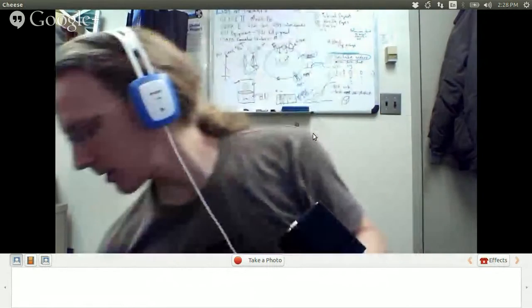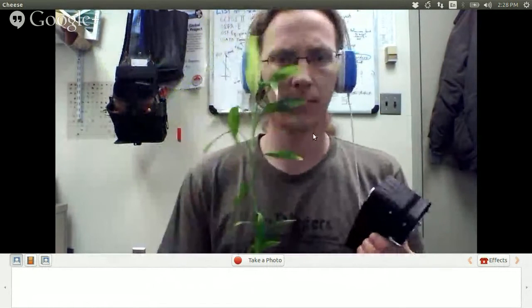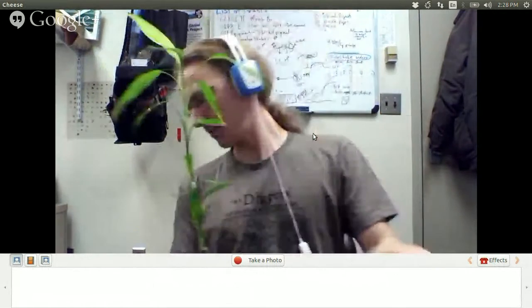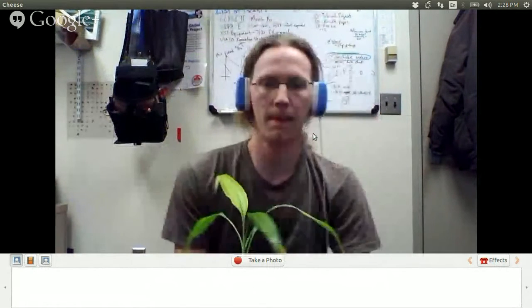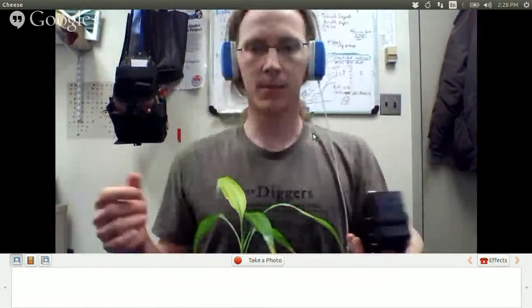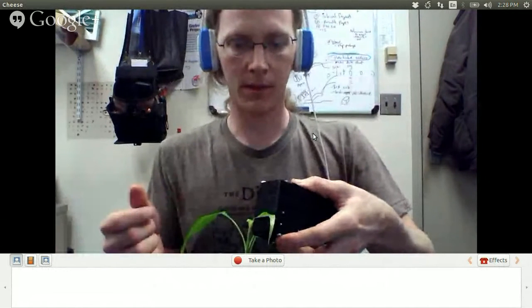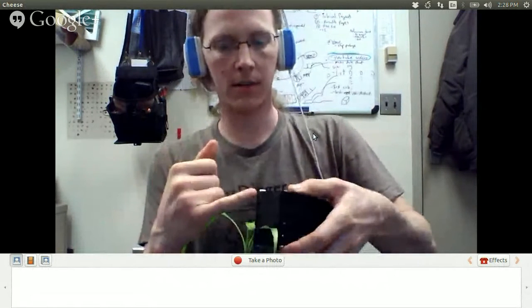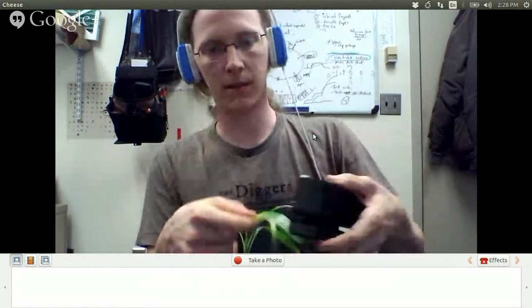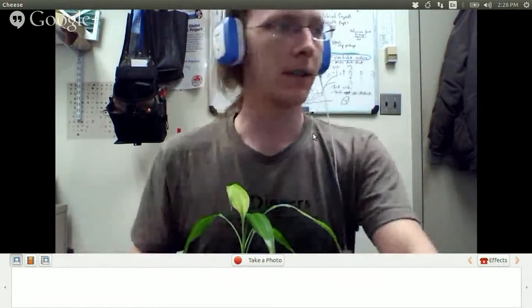And the way that it works is you take a plant like this one, set it here, and we're going to clamp the leaf. Press go, and that's going to take a measurement. We're going to get our light intensity from this sensor right here. It's going to match the light that is naturally seen by the leaf, and that's the result that we're going to see.